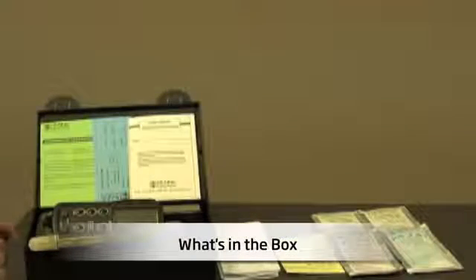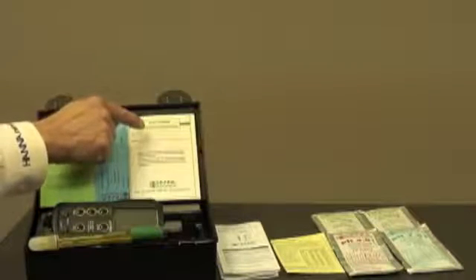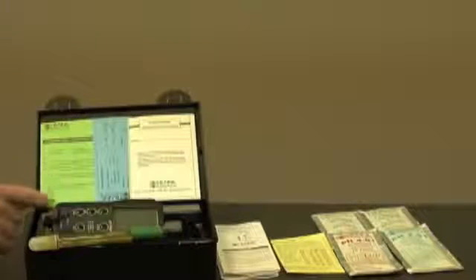Let me show you what's in the box. When your meter arrives, it'll come in this rugged plastic carrying case, complete with the calibration certificate for the meter, a testing certificate for your pH temperature electrode, the electrode instruction guide, and the meter.